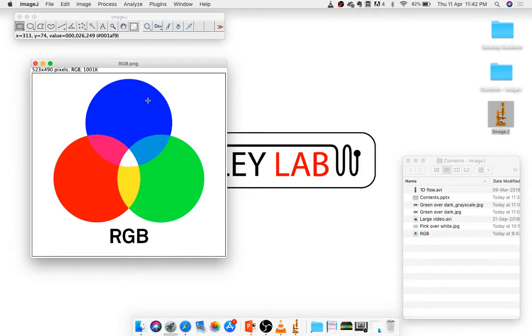If you understand that, you have now understood that any color can be represented by a combination of three fundamental colors, R, G, and B. In this case, they are on a scale of 0 to 255, and that is because this has been taken with the 8-bit camera, but those details I won't go into right now.